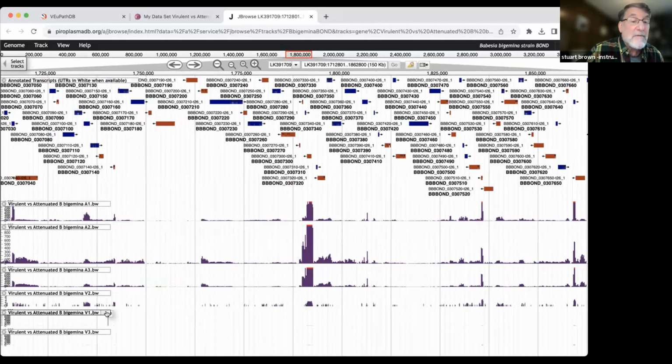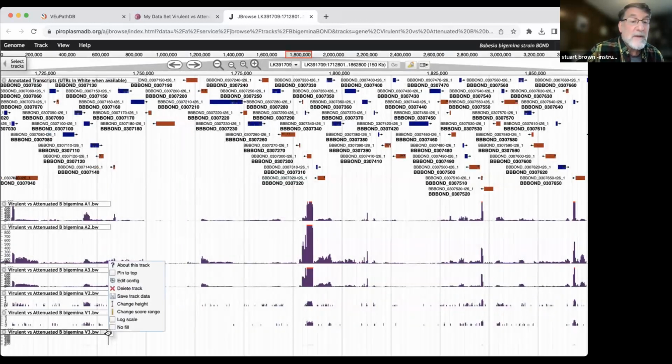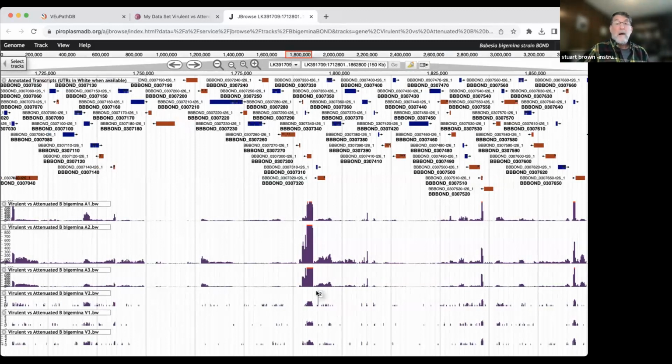I can see it if we change to log scale, but I'm worried about this in terms of calculating the fold changes when all of the samples in one treatment have about 1,000 reads covering this gene, and samples in the other treatment have 5 or 9 reads covering this gene.